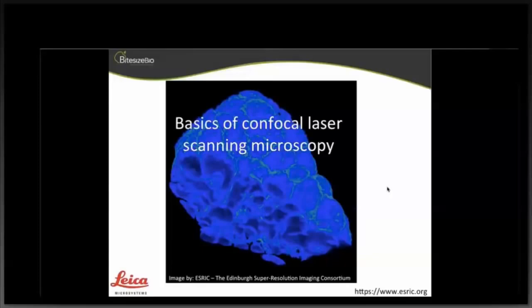Another question, Alison. What is the best way to deal with autofluorescence in terms of separating it from the real signal that you want to detect? I think with autofluorescence, the most important thing at the beginning is your sample prep. Sometimes using things which will quench your autofluorescence, making sure obviously there's no phenol red in your media, and things along those lines. I would also try and focus on not having your gain too high, because that's where you might detect it if you have the gain too high on your detector. Those are the key things I can think of.